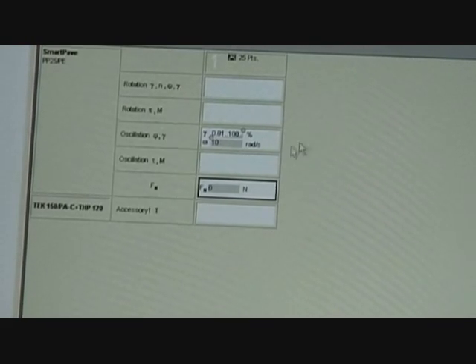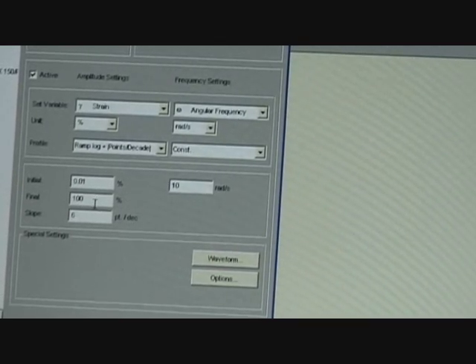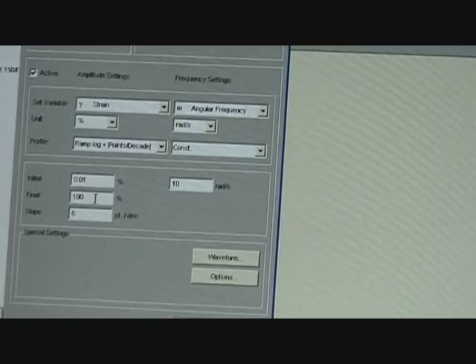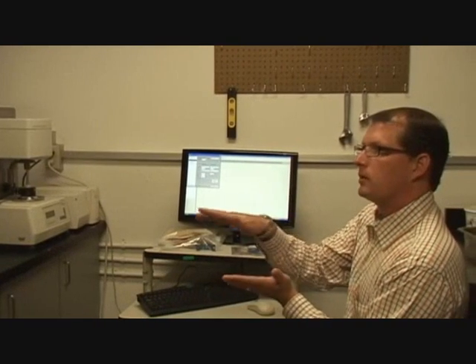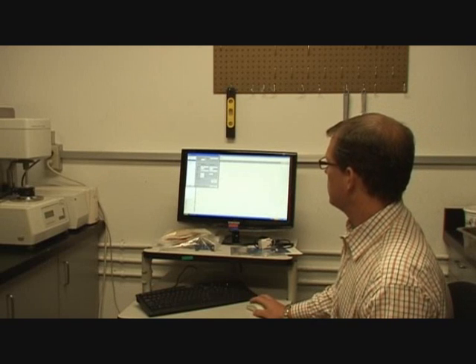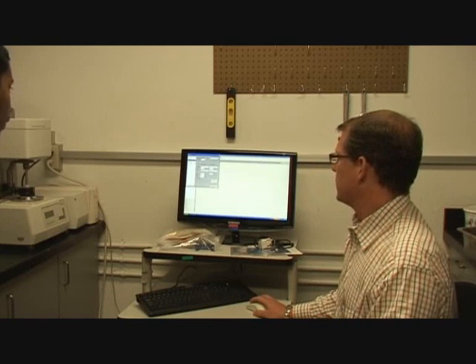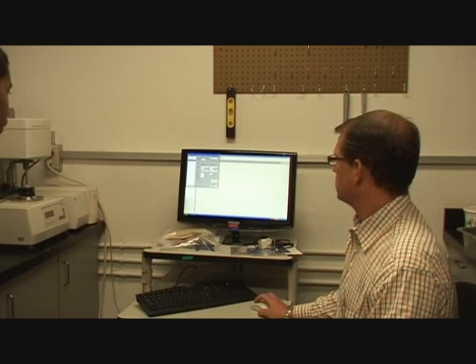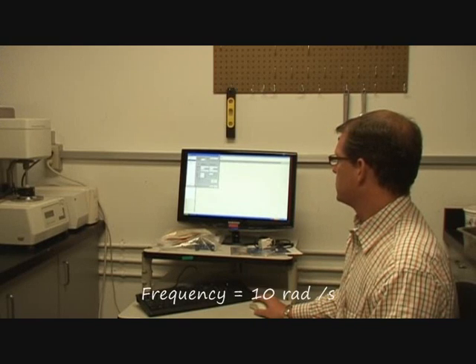So now what's going to happen is my test is going to do an amplitude sweep from 0.01 to 100% strain — it's going to start at 0.01 and go up to 100% strain. So if I'm at a one millimeter gap, it's going to start at 0.01 millimeters and go up to one millimeter. Six points per decade. At 25 degrees this is going to be pretty stiff — I doubt it will even get up to there.